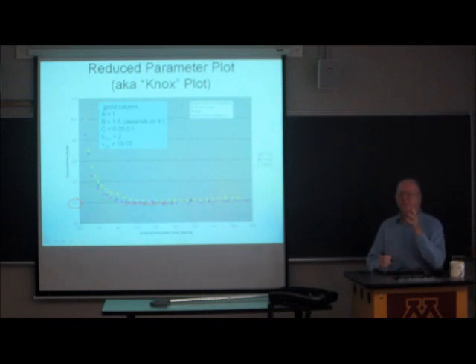If you want to know what's the best velocity to run at, all three of these, somewhere between 6 and 8, it's close enough to 10 to say, who cares? Okay? So your best reduced velocity is something a little bit less than 10. Now, to calculate the actual velocity, you need to know the particle size and you need to know the diffusion coefficient.